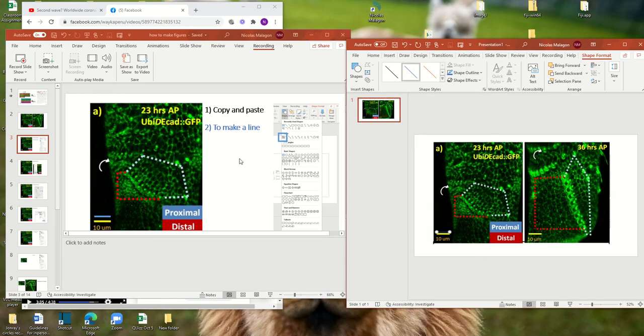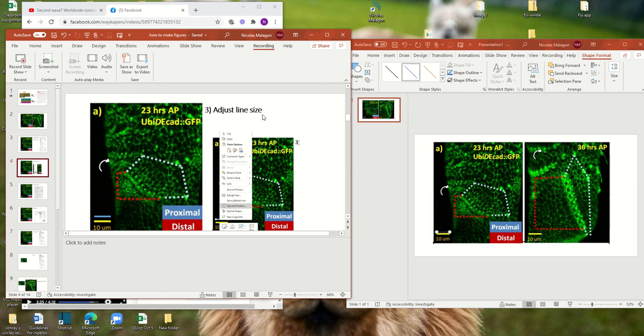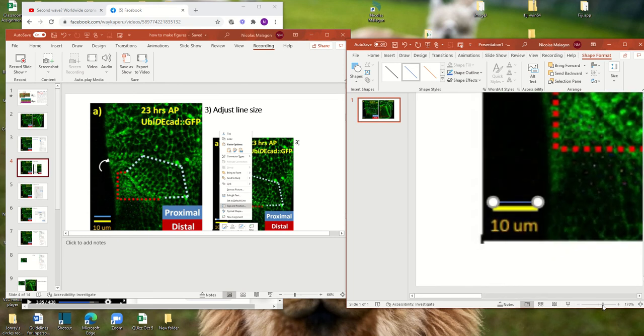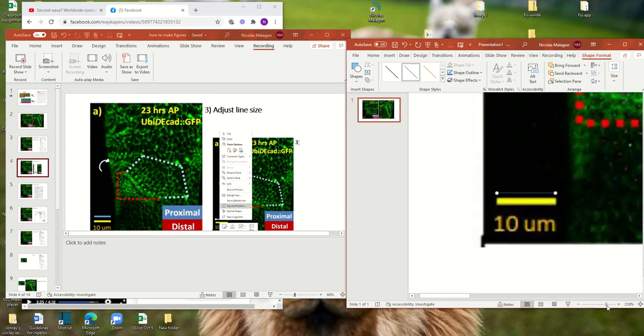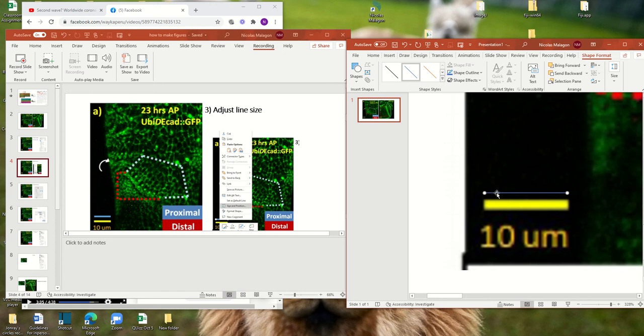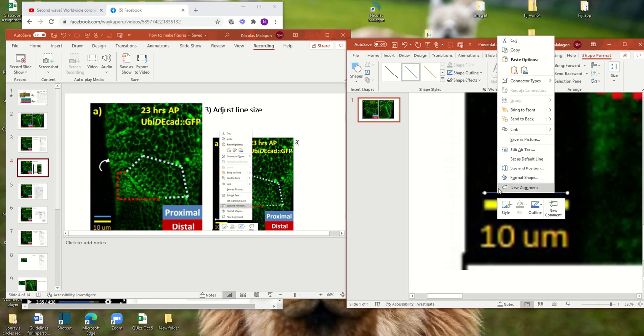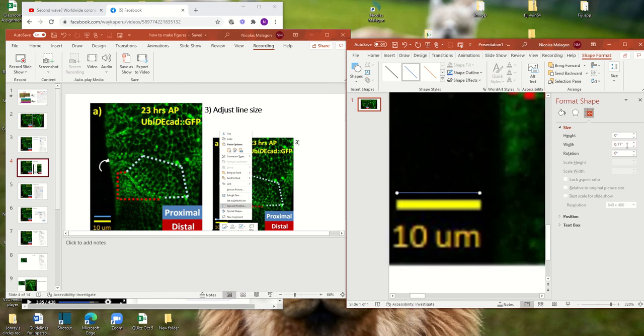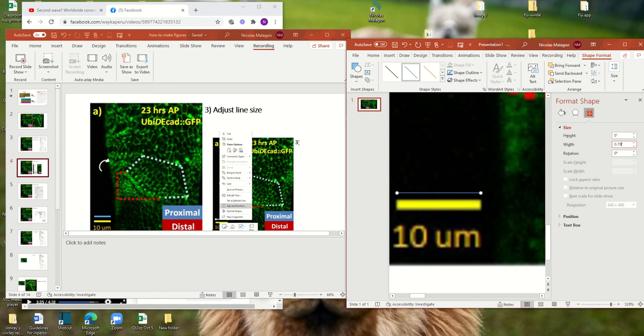So now we made a line. Now we need to adjust the line size so it is the same size as this one. So you go here down and zoom, and to make sure that you have a similar size. So later, you can left click here, and you go to size and position.